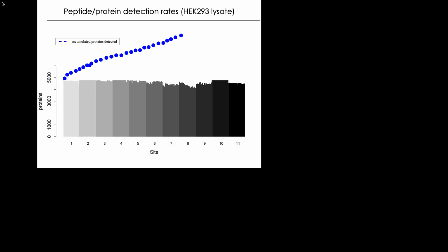I'm going to illustrate this with an example. This is from data-dependent acquisition mass spectrometry, and these insights were eventually translated into a tool by a student at the time in our group, Manfred Claassen, and he analyzed this accumulation of false positives, which we first realized when we started to collect data from multiple labs and tried to build a composite picture of the human proteome.